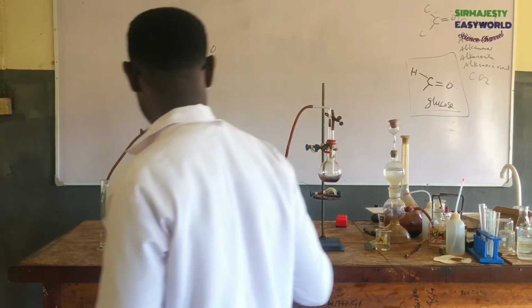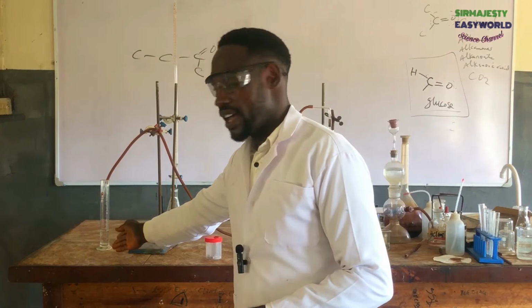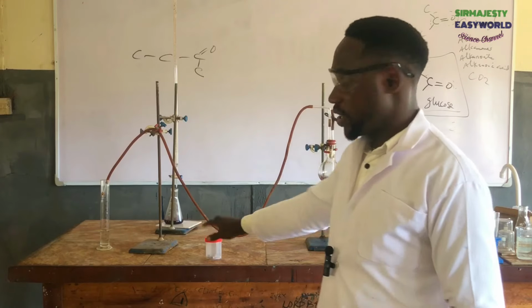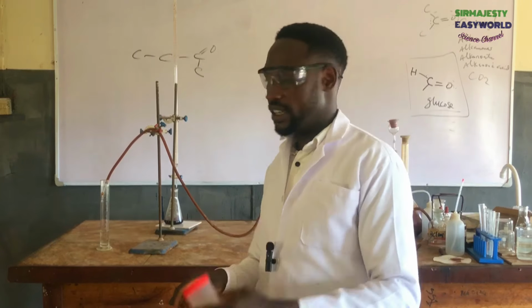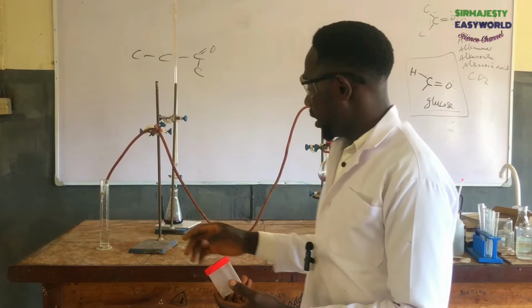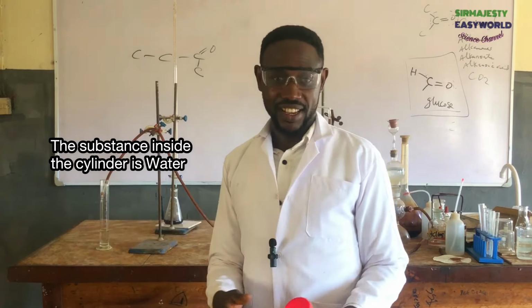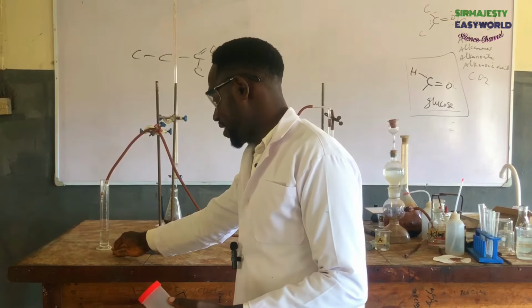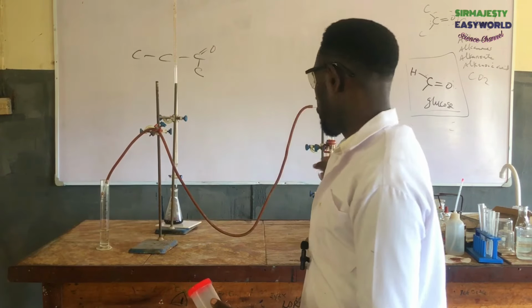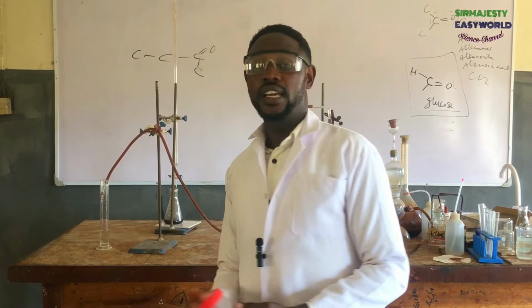So over here, I have what will produce the chlorine. Here, I'm going to get the acetylene gas. Over here is my calcium carbide, as small as it is. Calcium carbide reacts with water to release ethyne. So I'll put the calcium carbide here, and then I start producing my chlorine here. This little space is where the two gases will meet.